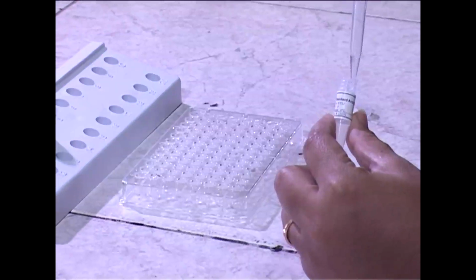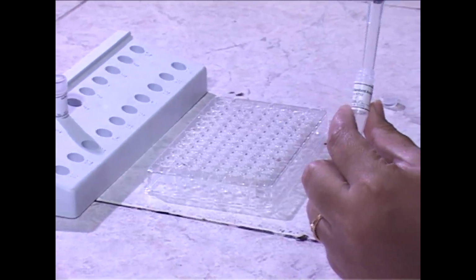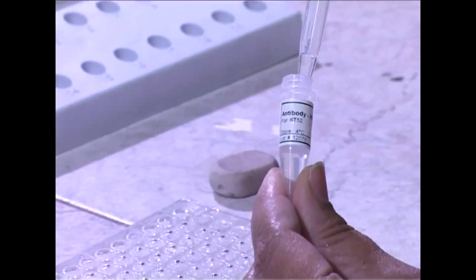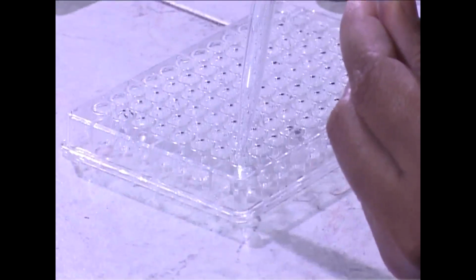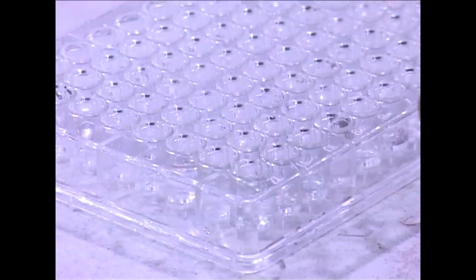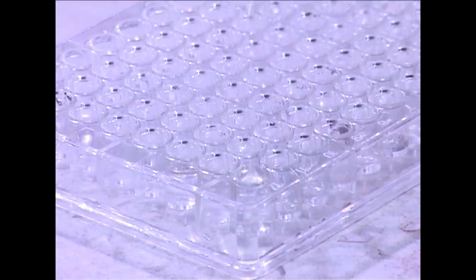Next, after washing the wells properly, we will add the antigen. If the specific antigens are present in the sample, they will bind to the antibody. Then again we have to wash the wells properly to remove all the unbound antigens. Next, we will add the enzyme tagged second antibody. Remember, this is not a secondary antibody. Secondary antibodies are generated against the Fc region of the primary antibody.